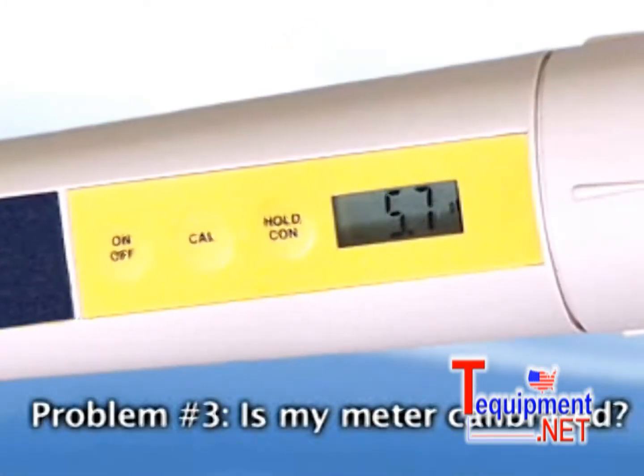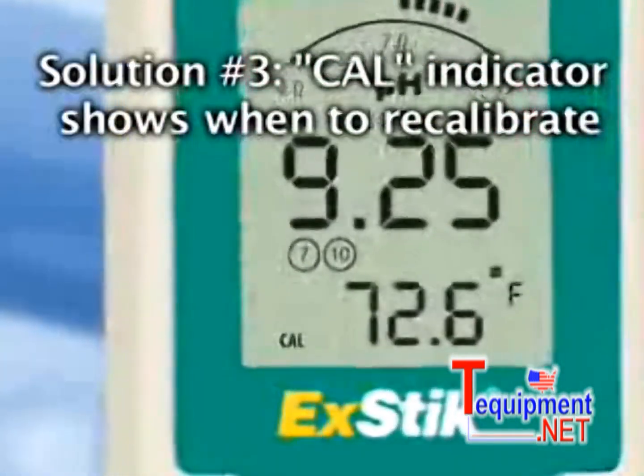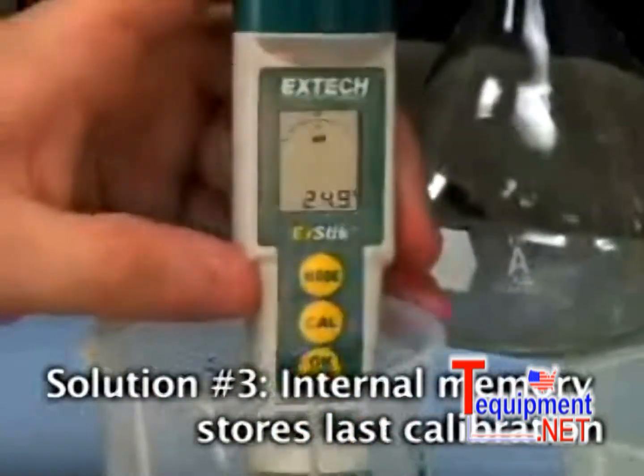Problem number three: how do I know if my meter needs to be calibrated? The EXTIC cal indicator will appear when it is time to recalibrate the meter. The internal memory will store your last calibration and will display on screen to eliminate any guesswork.